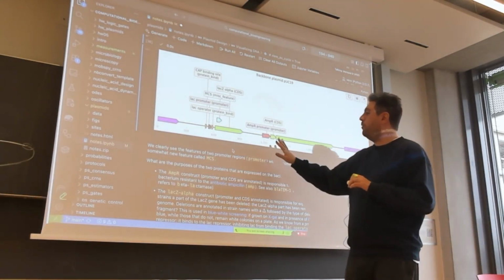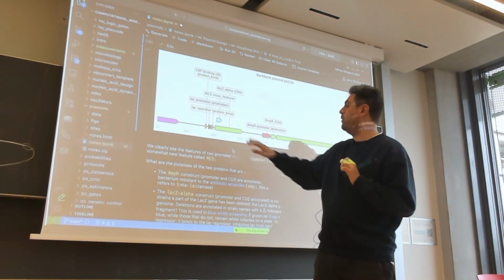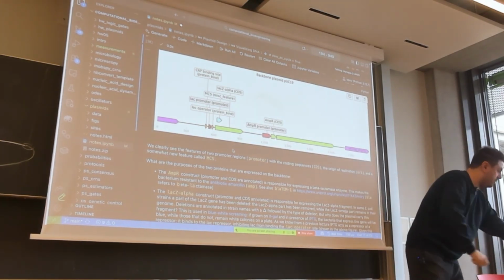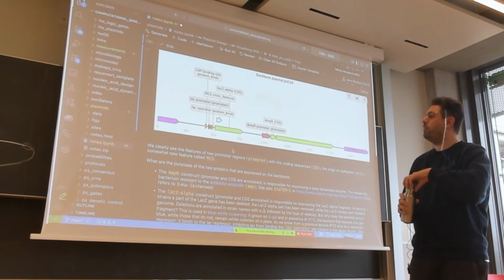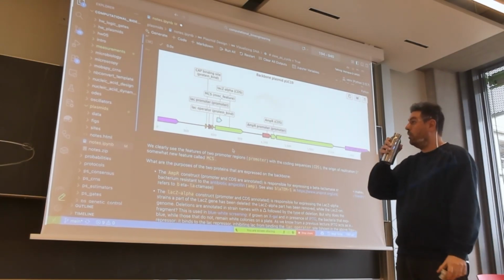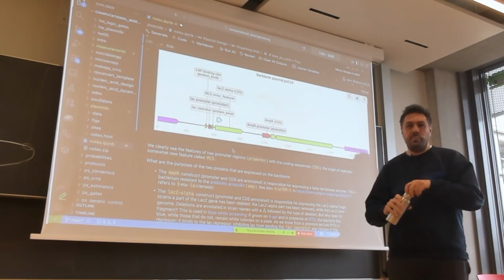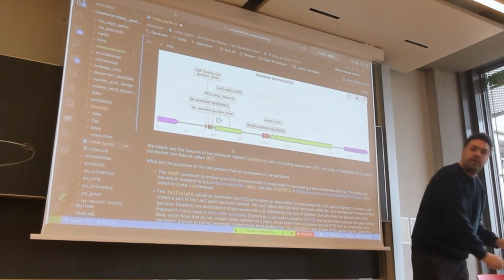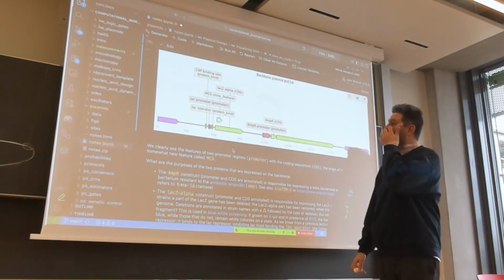Okay, so this is what remains, these two things. Yeah? And so what is that? You might perhaps even know that from previous lectures and homework. Because you recognize a lac promoter and some lacZ set here, which is a bit strange because it has a lacZ alpha, but I'm going to explain that.